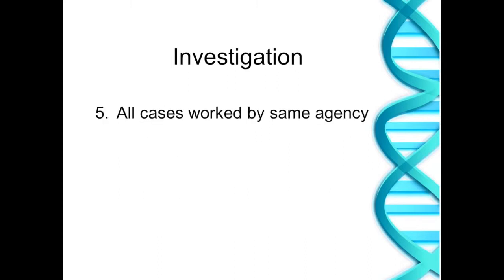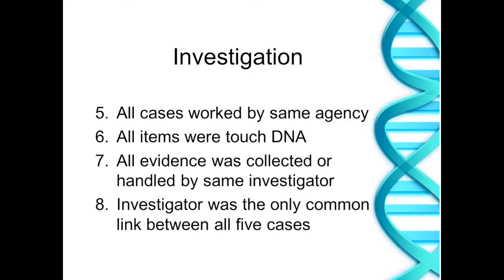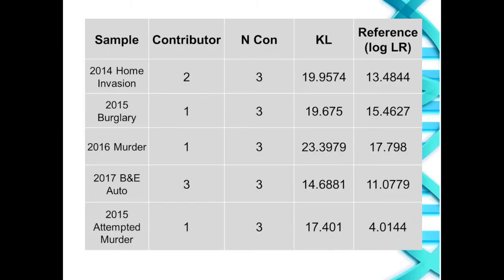We look back, where did the cases come from? Well, it was all the same agency that tested them. They're all touch DNA samples, so there's no body fluids here. And all the evidence was collected or handled by the same investigator. In fact, this one investigator was the only common link that we could find between all the cases that we had. So then we requested a reference standard from this investigator.